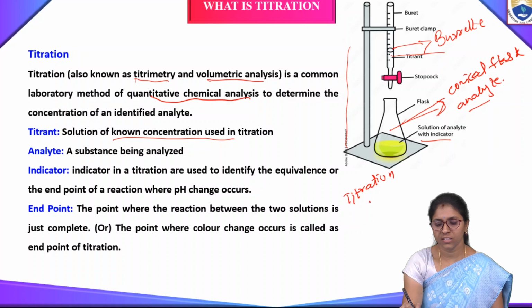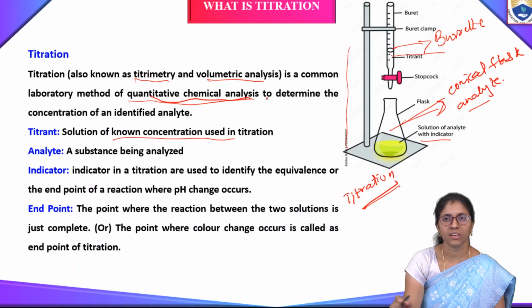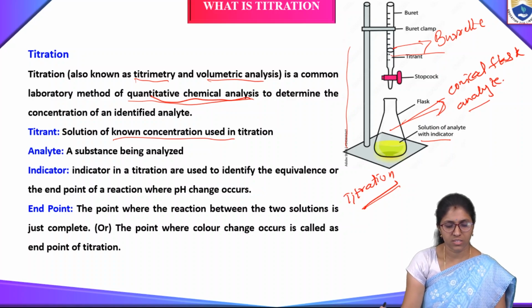By this titration, we measure volumes of the unknown solution. We measure the endpoint of the reaction by using volumes, so this is also known as volumetric analysis. Here we are measuring quantities, so this is also called quantitative chemical analysis.